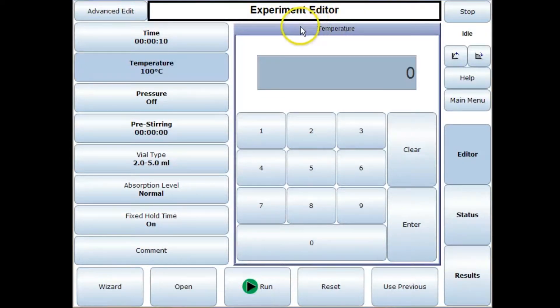This loads the experiment editor and what we have to do here is input our parameters for our desired reaction.